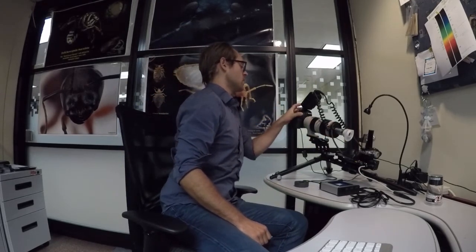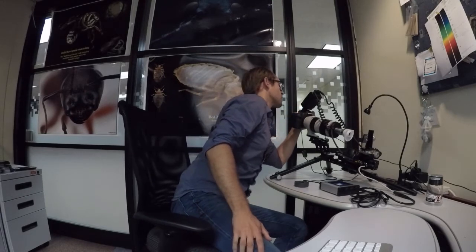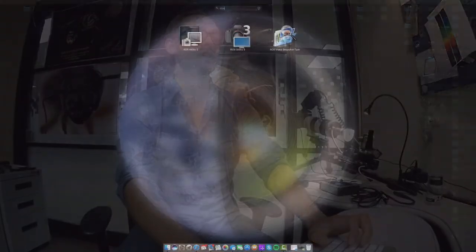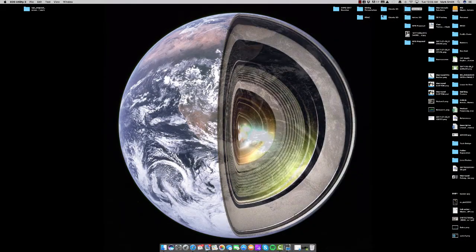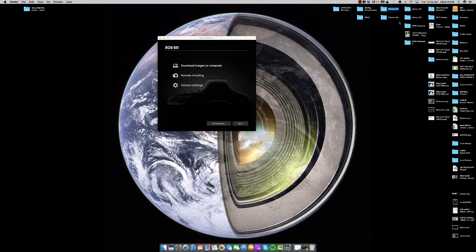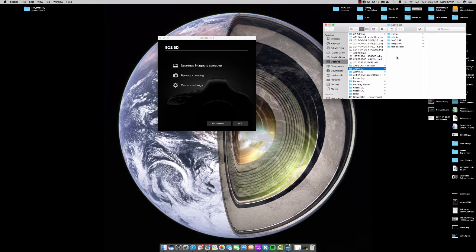I do have the camera turned on. Just make sure it's in automatic — at present it's in manual. We'll turn it on automatically for flash off, so we'll be able to see what it is that we're doing when we open our EOS utility. I'm going to go ahead and turn on the desk lamp so I can see what I'm doing as well. So now I'm going to open EOS utility, navigate to the same folder where we stored our 10x image which was in active 2D, and then we'll open up the Weevil scales.